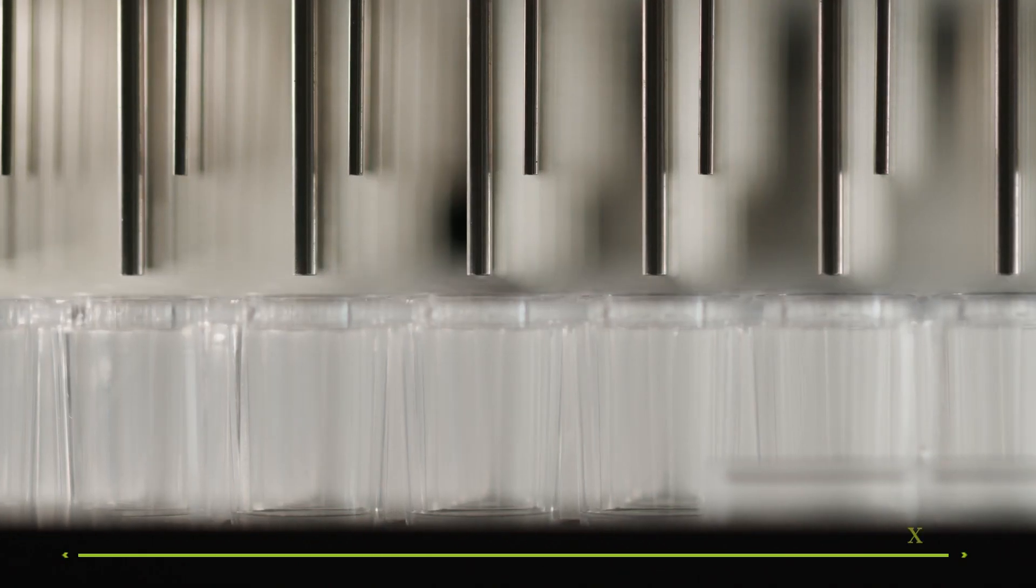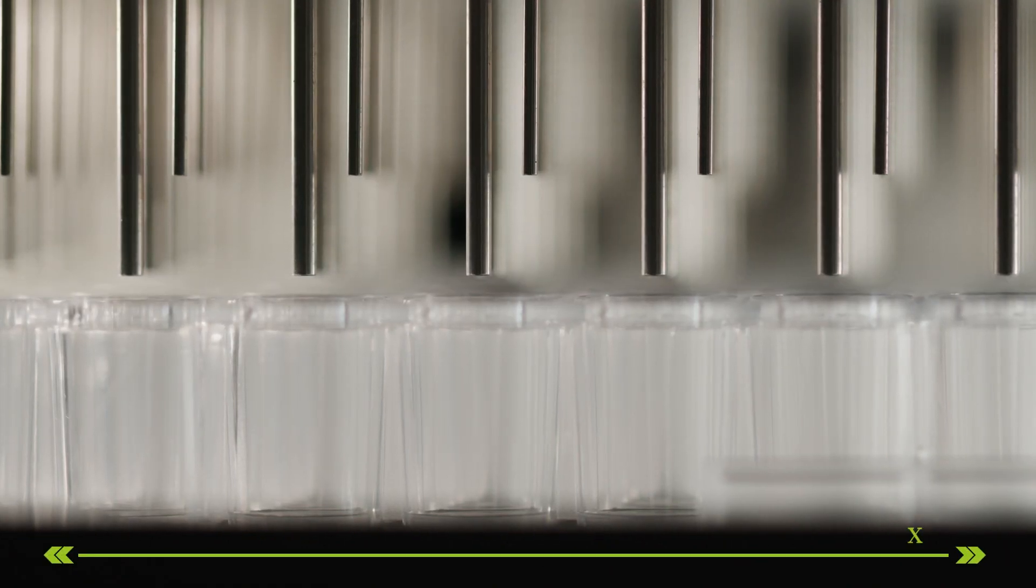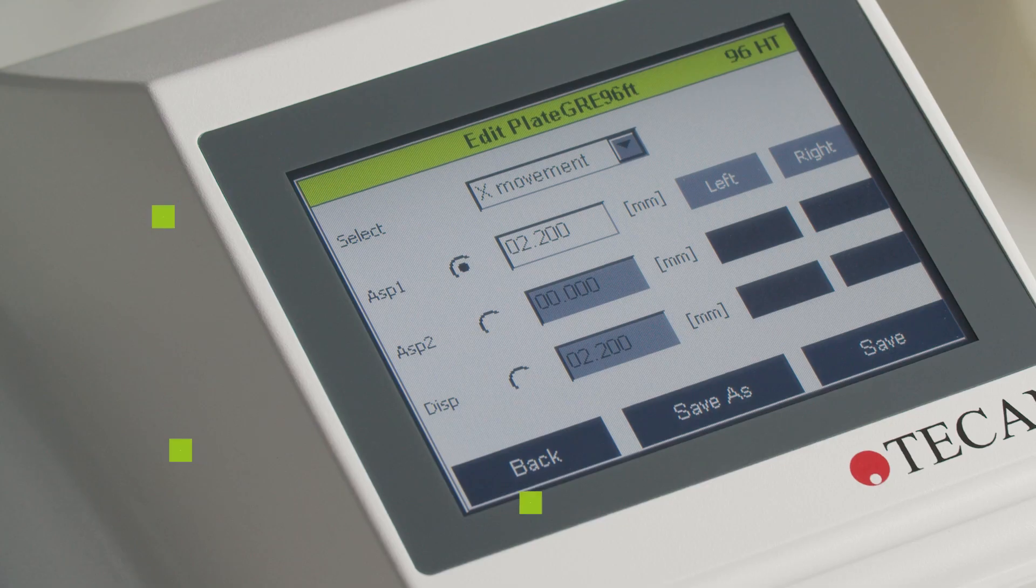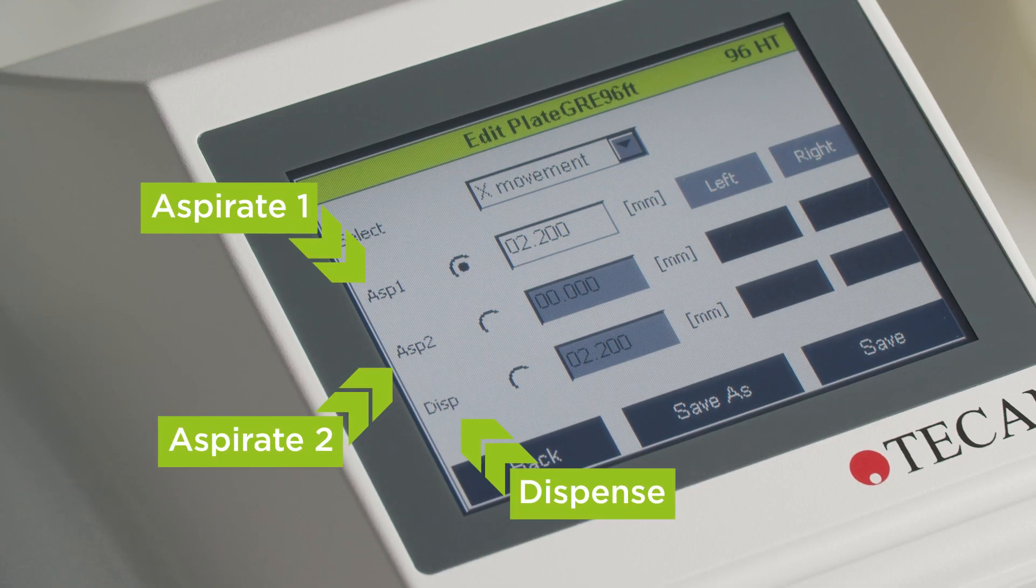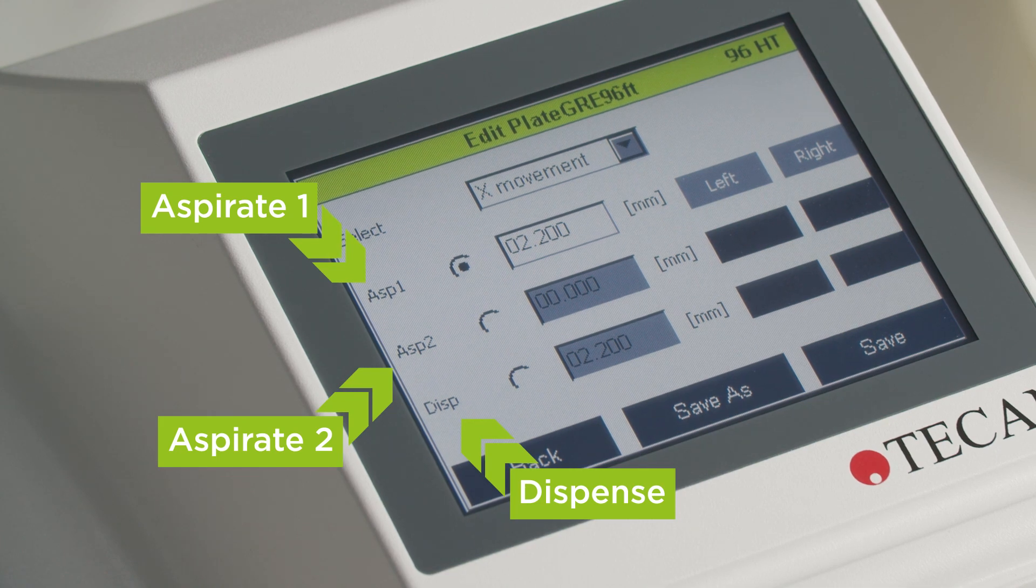X movement is the movement of the needle from the centre of the well to the left and right side. This includes the aspirate 1, aspirate 2 and dispense positions. The long needles are used to aspirate and the shorter ones to dispense.